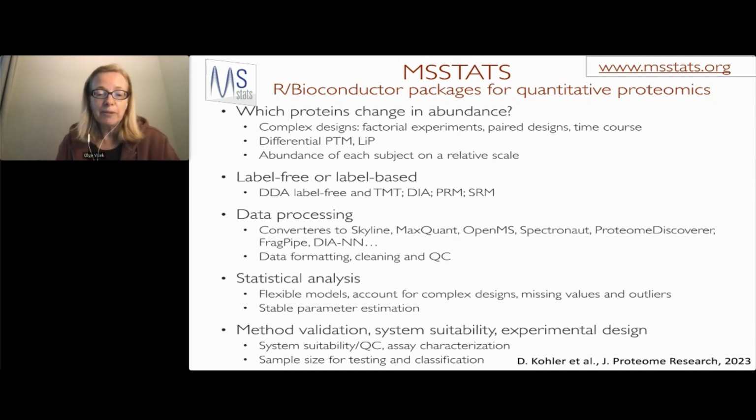When we take the output of these tools as input to our methods, this data needs to be prepared in the right format. We developed many converters that do that. They don't just prepare and massage the data, but they also do additional data analysis and preparation steps, which consider the quantitative information between the runs. For example, we can filter out some features which are redundant.